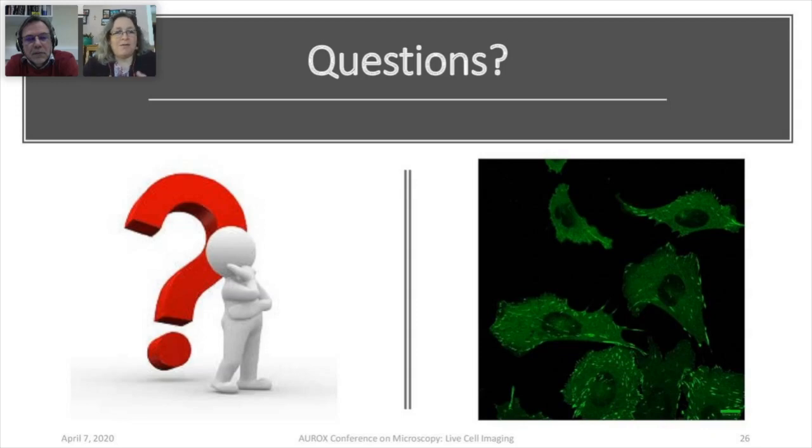And I think that was always kind of the way I was thinking about it. After discovering this illumination overhead and the impact it was having here, I think it really depends on the density of the light. I think this is going to be more of an issue for things like laser scanning, confocal, multiphoton, where you have a very, very physically restricted dose of photons as well. But in wide field illumination, I think the light is diffuse enough that it's not causing a lot of higher order processes to happen.